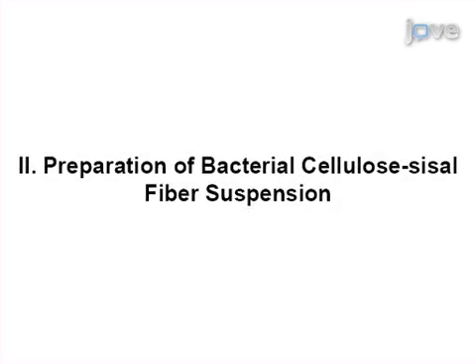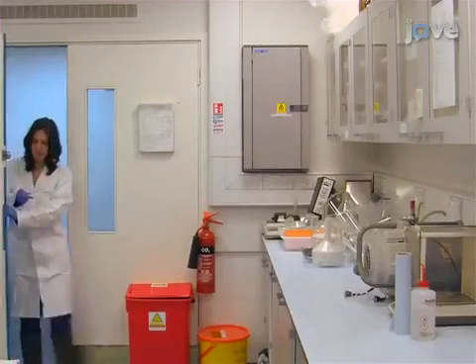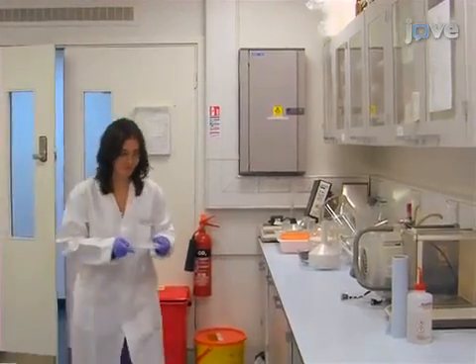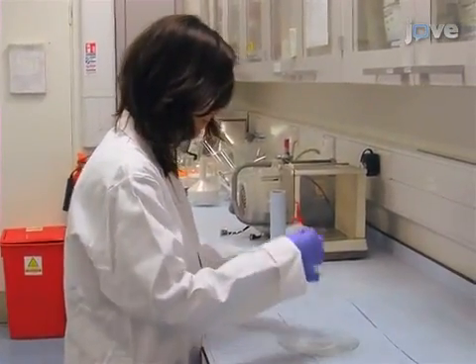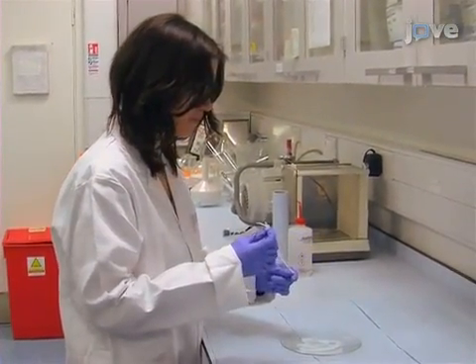Prior to starting this procedure, measure the amount of wet bacterial cellulose pellicles equivalent to 18 grams of dry bacterial cellulose from a predetermined wet to dry mass of bacterial cellulose.